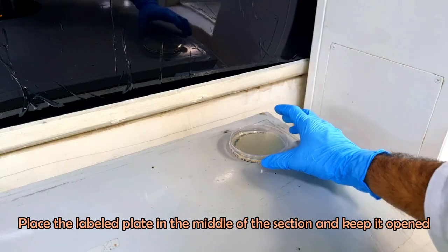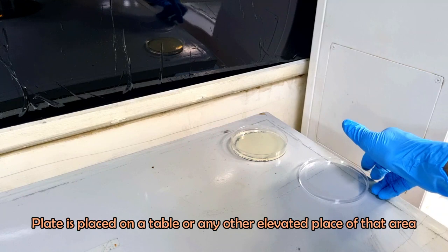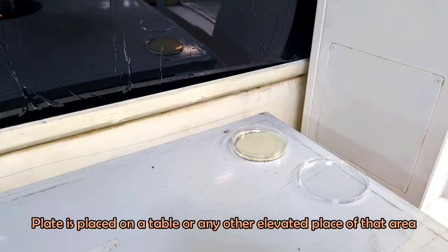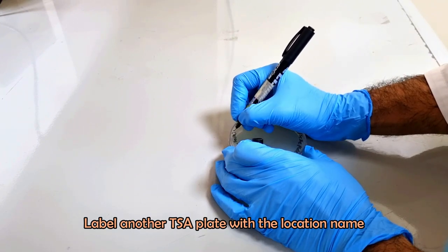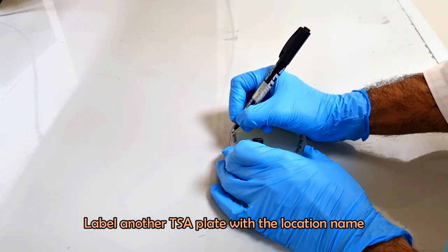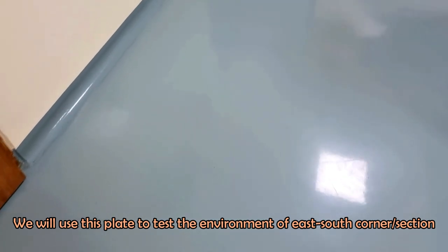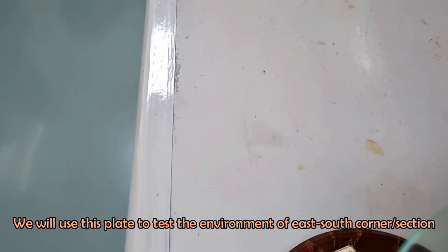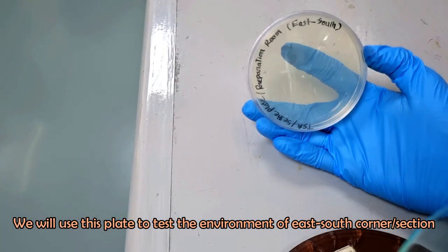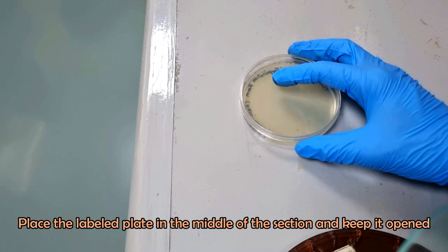Place the labeled plate in the middle of each section and keep it opened. The plate is placed on a table or any other elevated surface in that area. In this way, place a TSA plate in each section of the room.